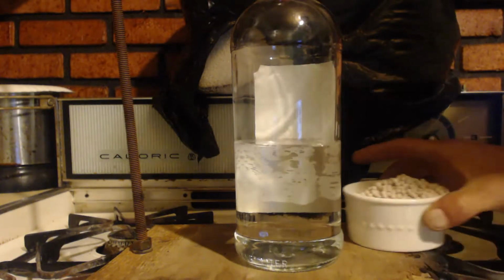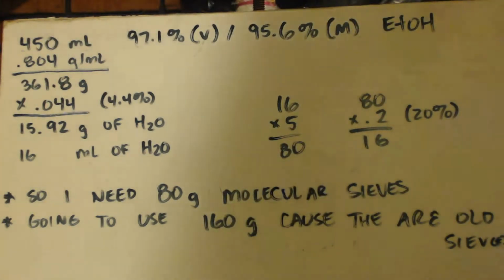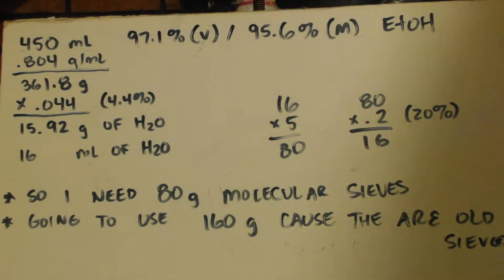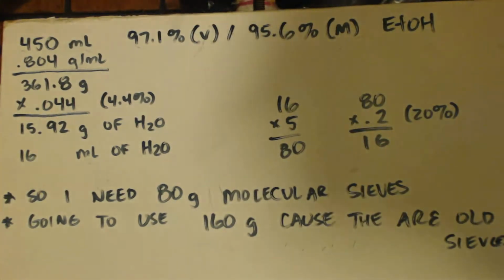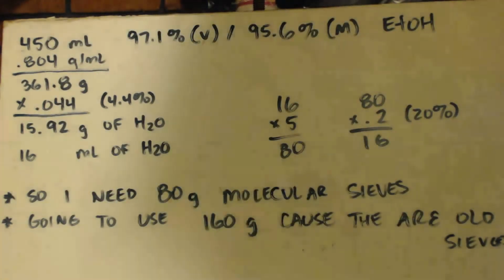We got 160 grams of sieves. All right, so how many sieves do I need? Well, I distilled out about 450 milliliters of azeotrope ethanol, right? I didn't measure it or whatever. It's about that. It doesn't matter because I'm going to add extra. The density was 0.804. That's what the density is for azeotrope. I think mine was 0.8042 or something. It was almost exactly the same. So I got 361.8 grams. Okay, that 450 milliliters weighs 361.8 grams.